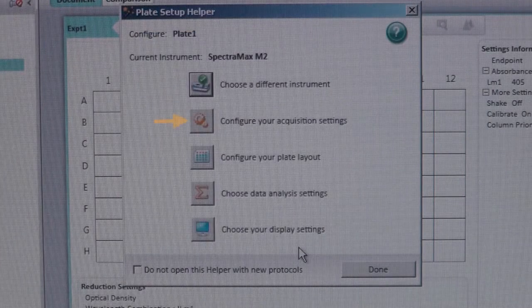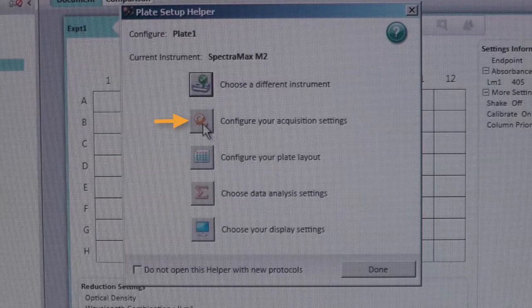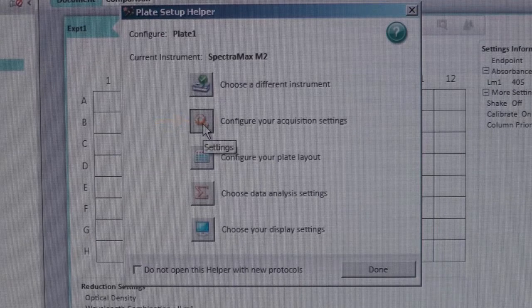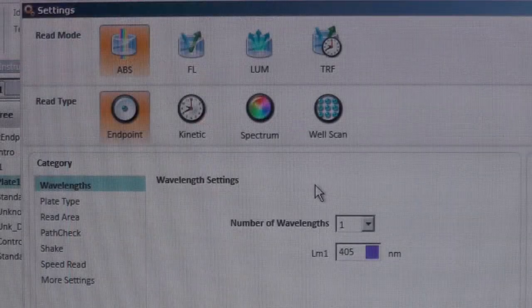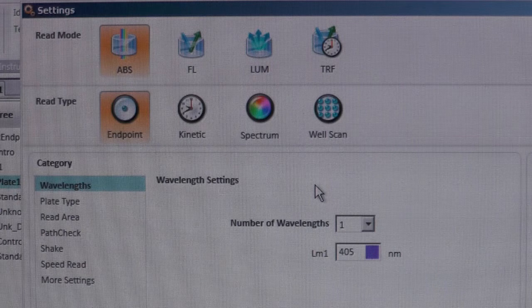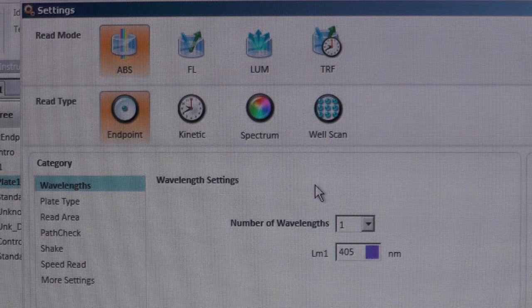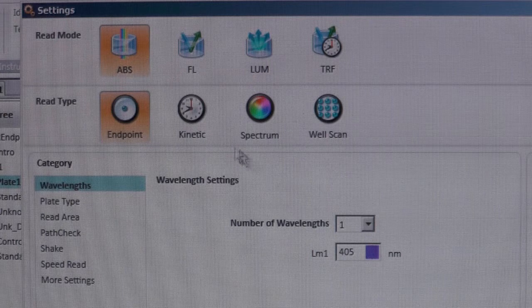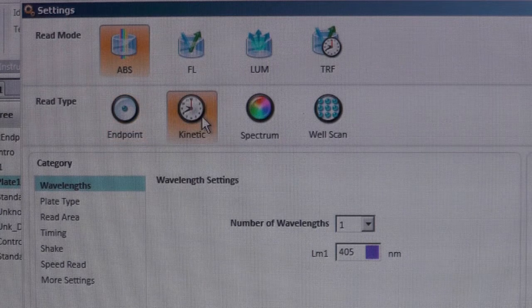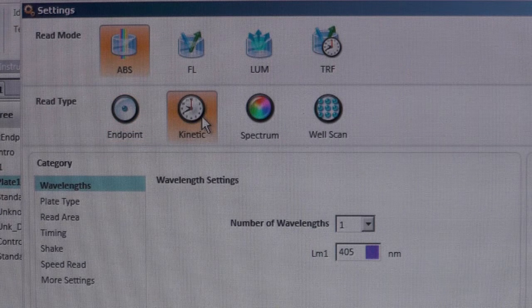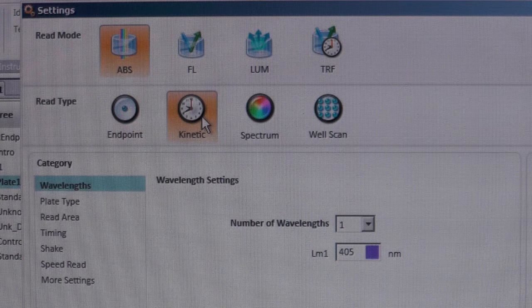Next, select the Configure Your Acquisition Setting icon. There are several different options with Endpoint and Kinetic being the most frequently used. The Endpoint option is to be used if you only need a single reading, while the Kinetic option allows multiple readings with customizable reading intervals.